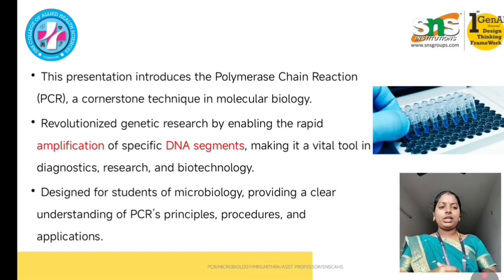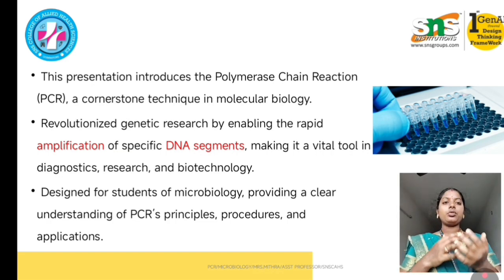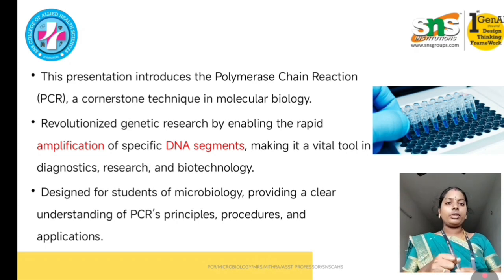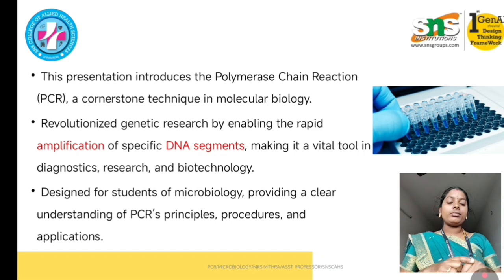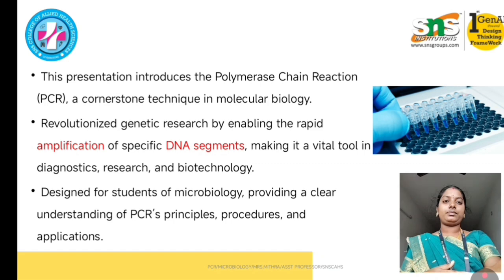So this presentation introduces the students to more knowledge on the polymerase chain reaction, which is a very important technique in molecular biology, where it can amplify specific DNA fragments, mainly as a tool in diagnostics, research and biotechnology. It is mainly designed for microbiology students who are eager to get a proper understanding of PCR and its principles, procedures and applications.